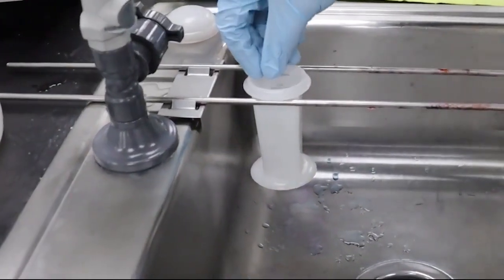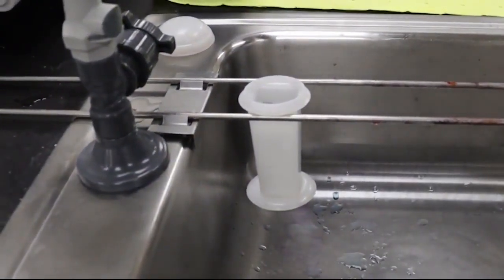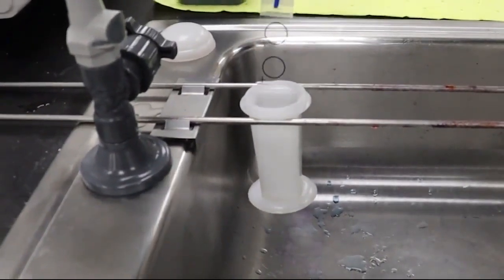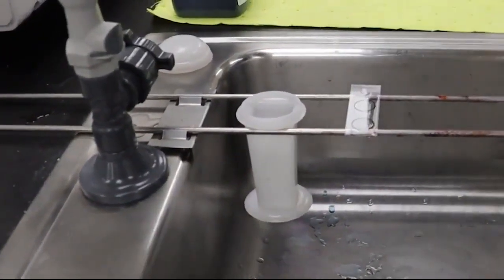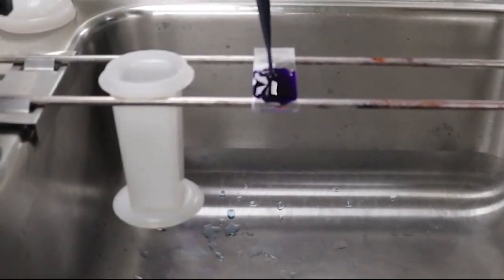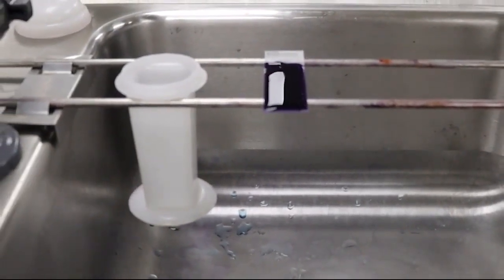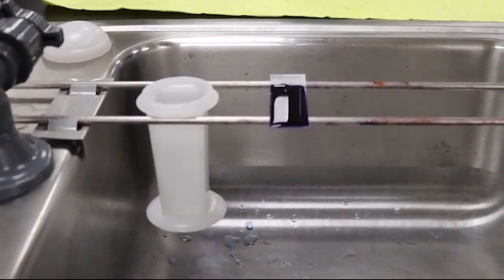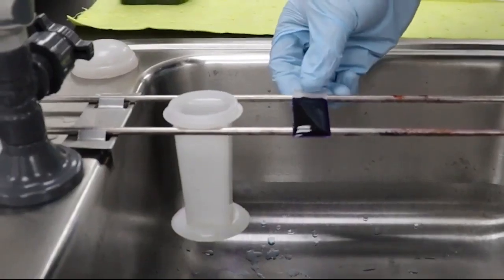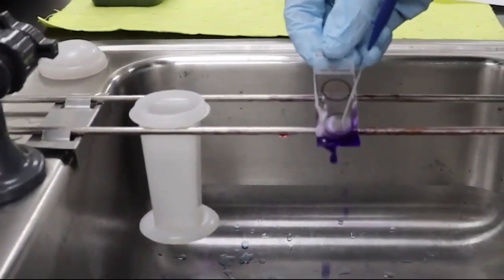Now we are going to take a look at an example manual gram staining procedure. We start again by fixing the slide in methanol and also allowing the slide to completely air dry afterwards. We are then going to apply our crystal violet solution to the slide for 30 to 45 seconds. It's important to apply enough liquid to the slide to completely cover the sample and prevent drying. We're then going to rinse the slide carefully but thoroughly with deionized water or tap water.